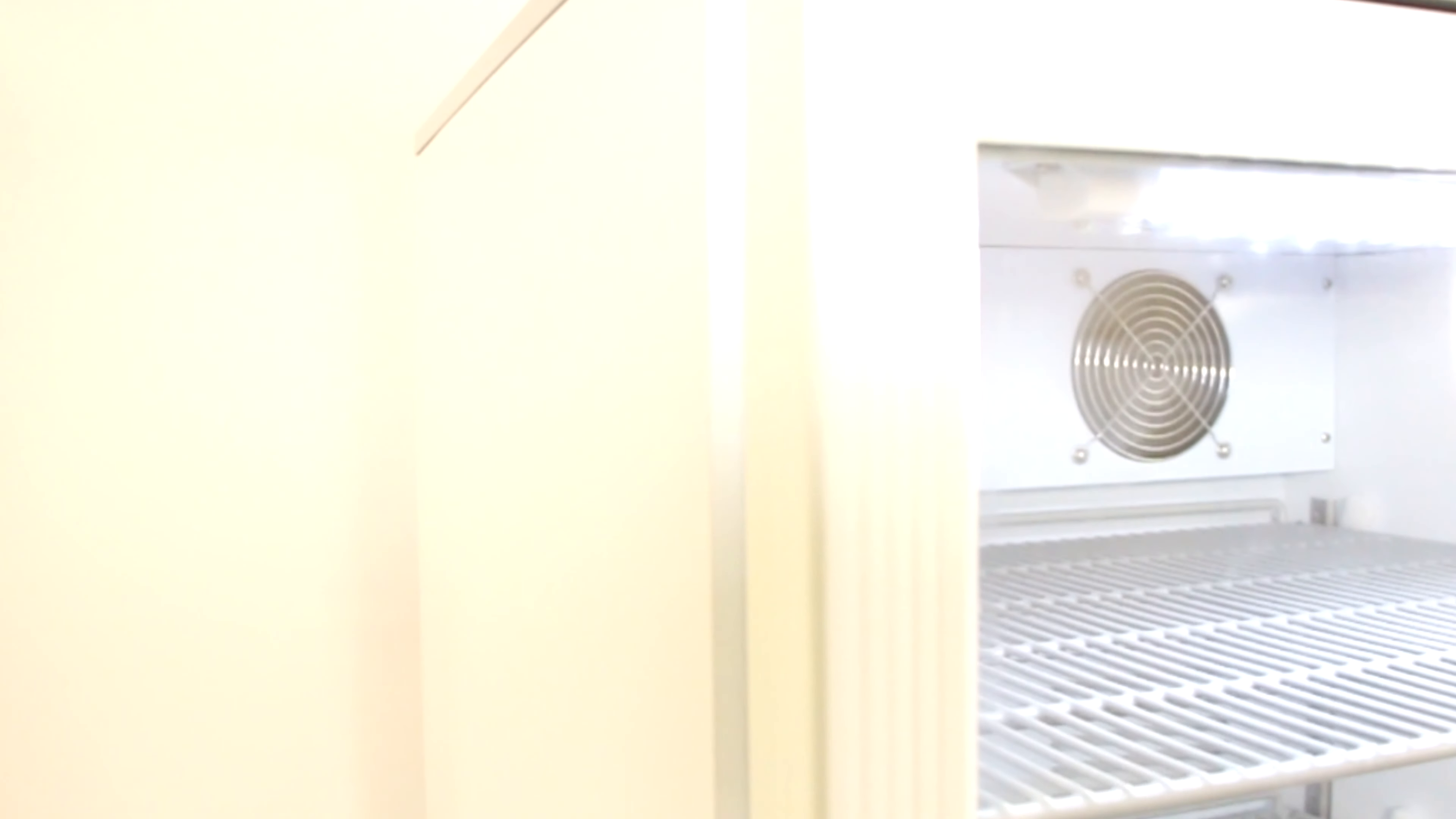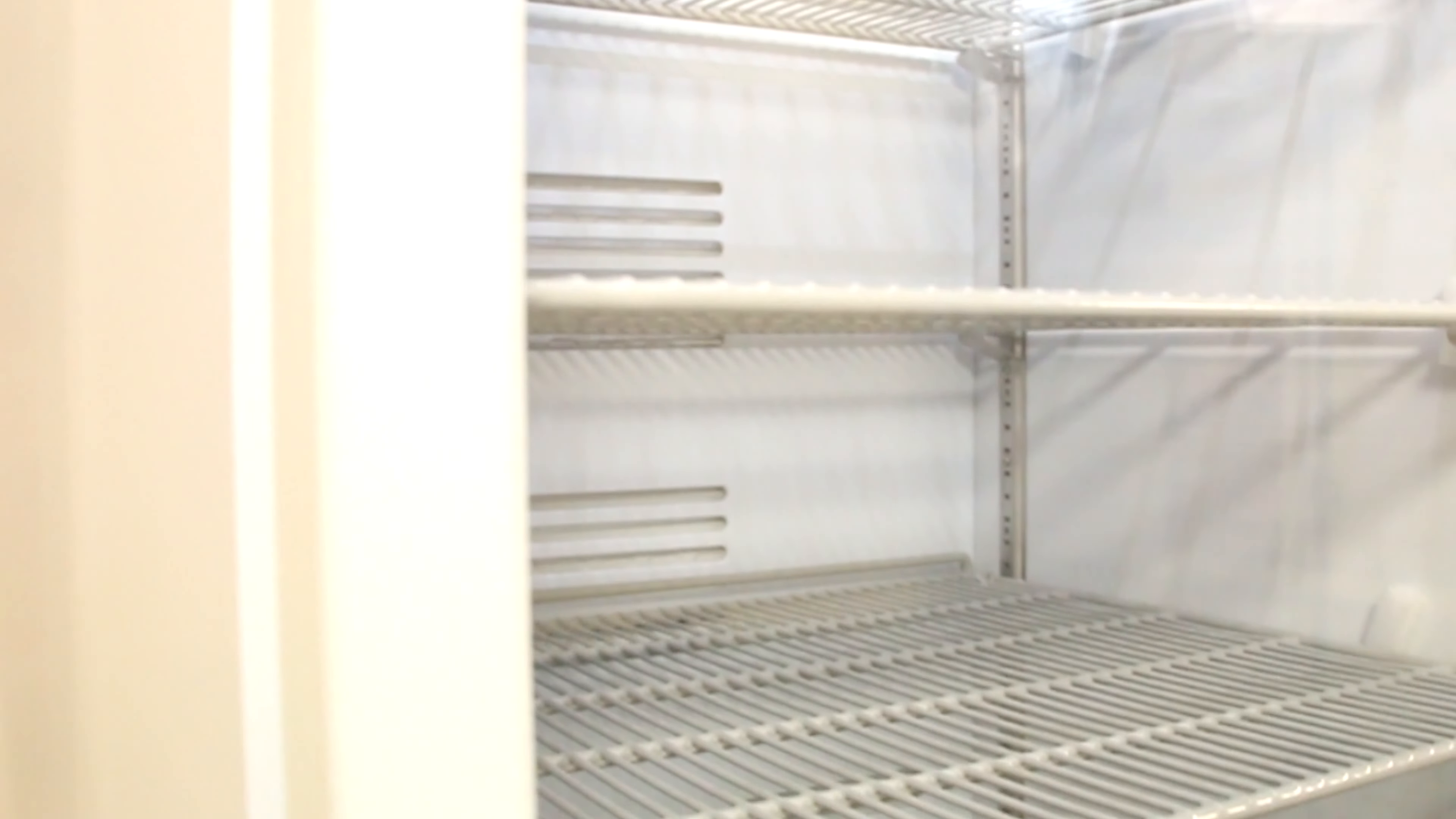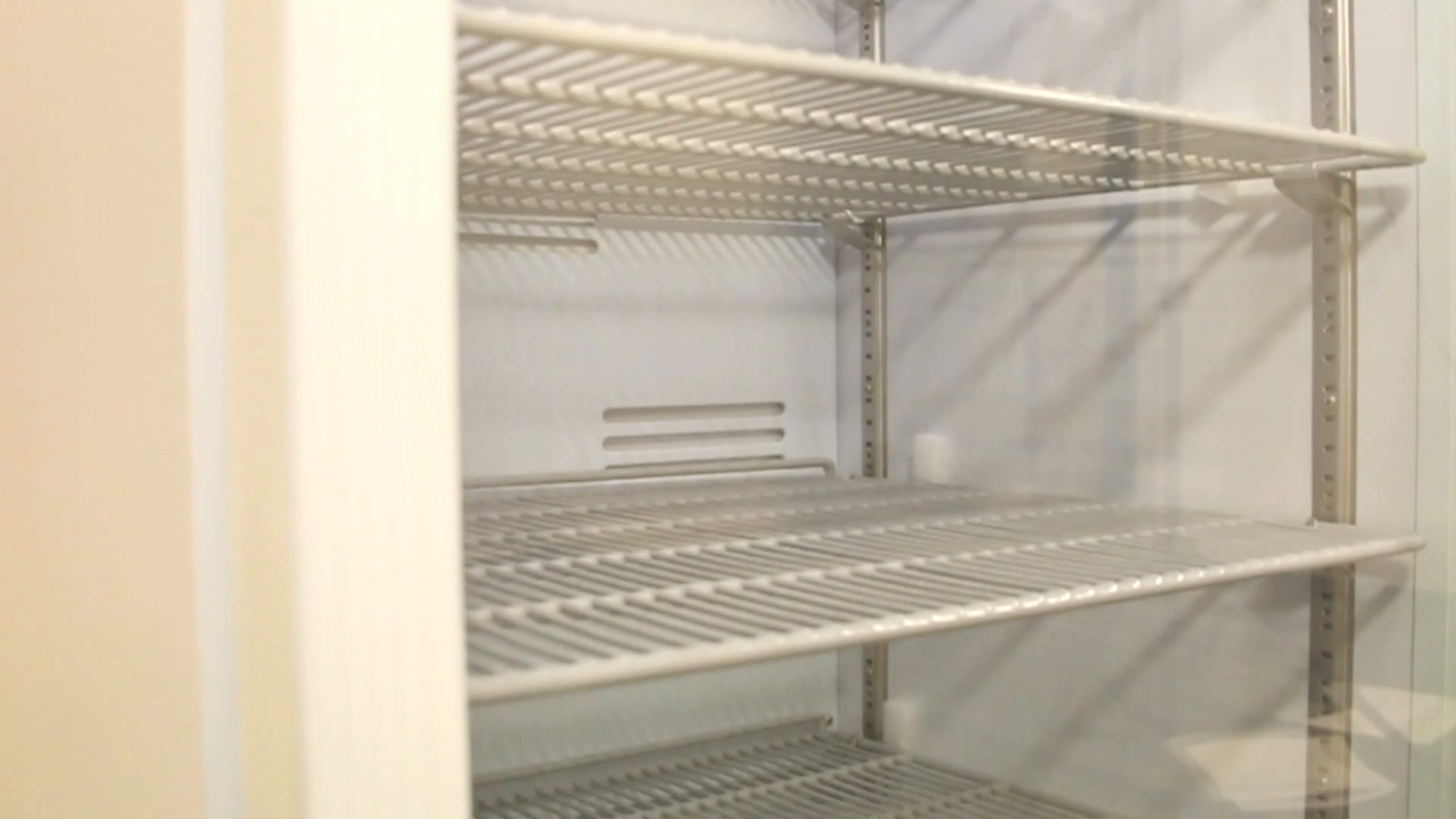This model features a full glass front. This allows you to see the contents from the outside without opening the door and altering the internal temperature.